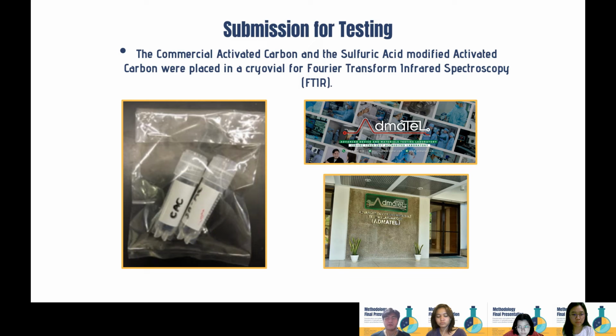So, as we finished the methods, we prepared the samples for testing. The commercial activated carbon and the sulfuric acid modified activated carbon were placed in a cryovial and submitted to Admatel in Bicutan, Taguig City for Fourier transform infrared spectroscopy. They said that the results will be released after 10 to 15 working days.